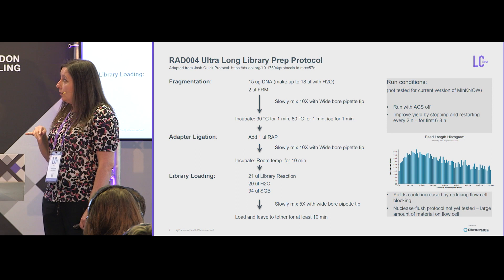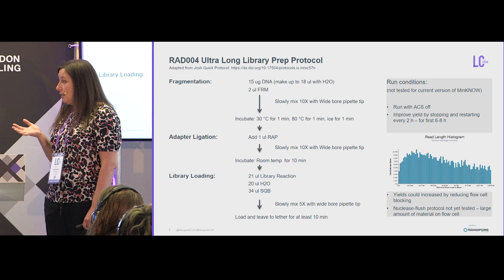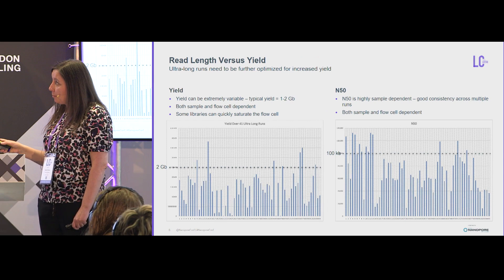To improve yield, we were stopping and restarting the run every two hours. Our director Matt Luce was in charge of this — he would hate it when I'd only start runs at 6 p.m., because he'd be up right through the night stopping and restarting them. A major limitation of this protocol is still yield, due to rapid flow cell blocking. We haven't yet tried the nuclease flush protocol on these because we're putting such a massive amount of DNA onto the flow cell and clogging it anyway, but we'd be interested to see if it would help.